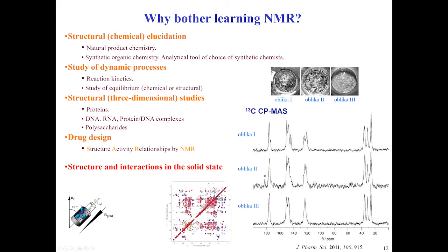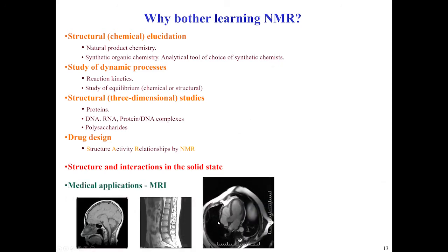A little note, nowadays, and nowadays it means the last 10 years, two-dimensional NMR has really evolved, and nowadays many groups around the world would be able to do high resolution structure in the solid state, in the powdered form or crystalline form, exactly analyzing this sort of correlations in two-dimensional spectra, providing restraints.